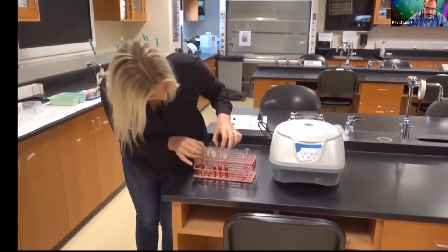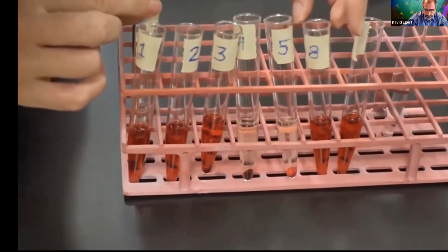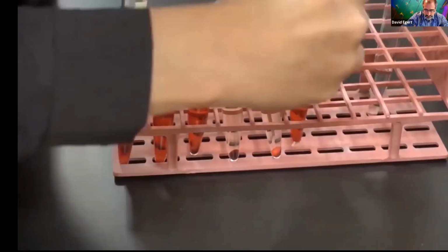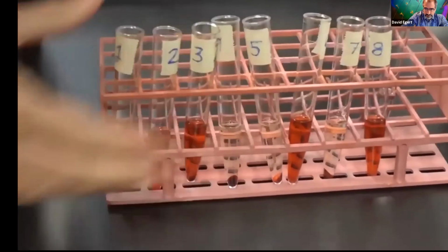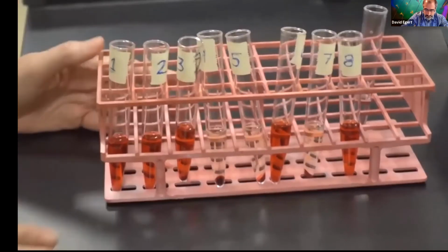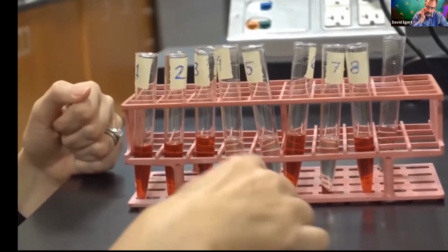So we have 1, 2, 3, 4, 5, 6, 7, and 8. And if we just do a visual look of these, you clearly see number 4 and 5, they have clear supernatant.